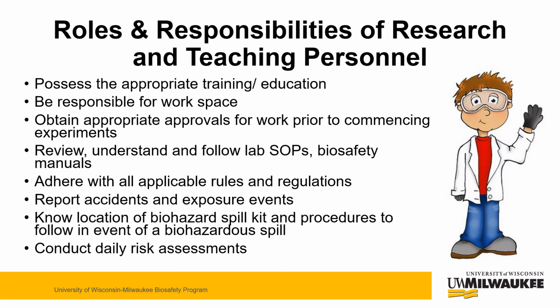Now let's turn to the roles and responsibilities of research and teaching personnel. It is your responsibility to possess the appropriate training and education to handle the biohazardous materials being utilized in your laboratory. It is your responsibility to be responsible for your work and maintain a safe and organized workspace. You must submit biosafety protocols on behalf of your principal investigator and obtain approvals prior to commencing experiments.